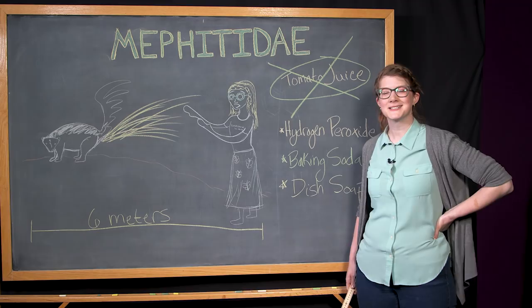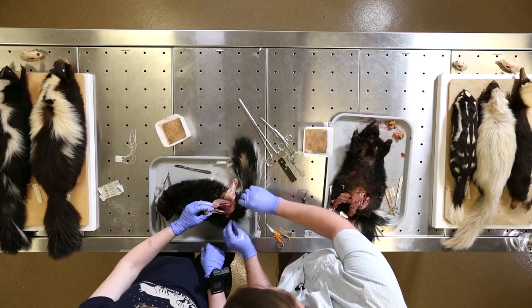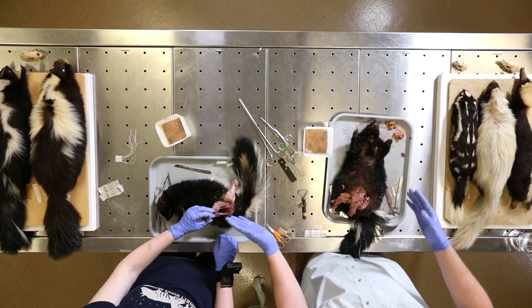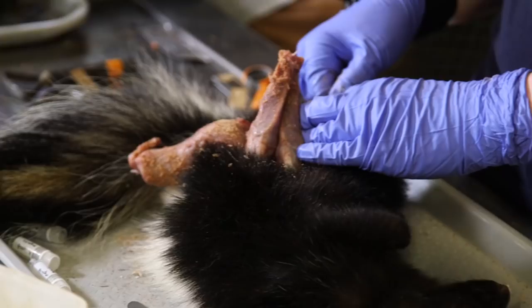There's the start of the glands — you see this goofy ball? That's the start of it. Now what we want to do is skin around the glands coming from the head side out. You'll have to cut a little bit here to get closer to the anus, but you don't want to cut too close or you'll cut through the glands. This is the most stressed I've ever been for a dissection.